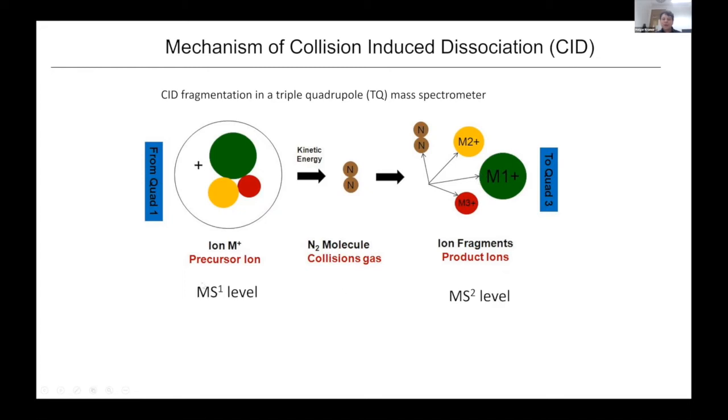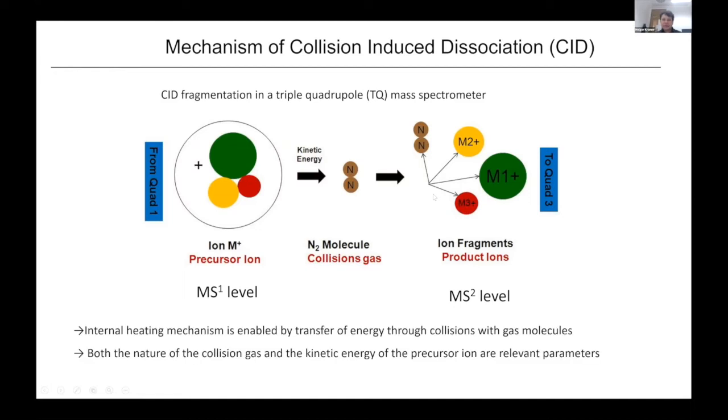What we are able to do is define a peptide signal through both the mass of the precursor ion and the masses of various fragment ions. That is something that can be exploited in a targeted proteomics approach. So what we're doing here is not actually discovering what proteins are present in the sample.